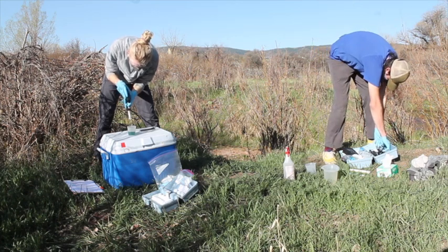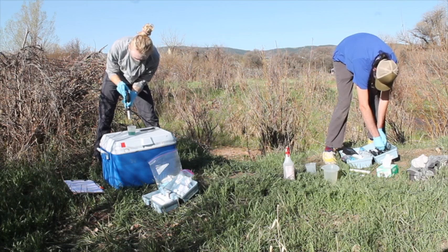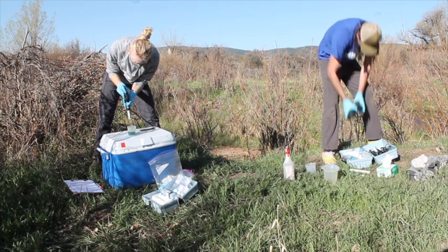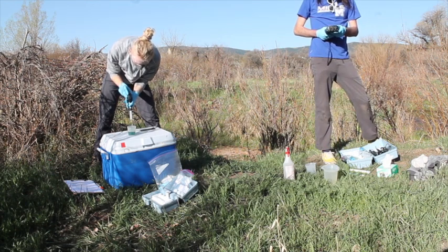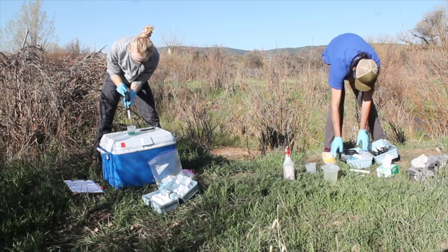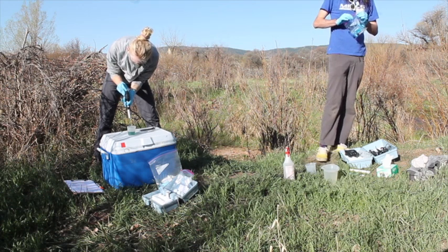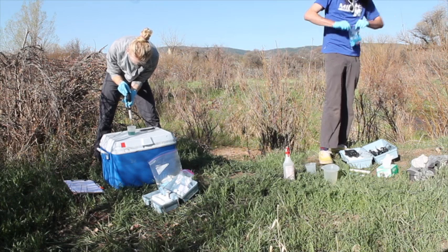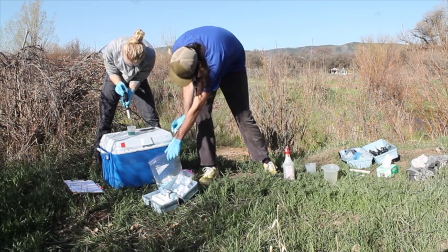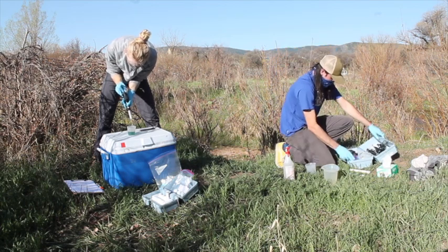Our conductivity was all around 309, so I'm pretty sure I made the right decision on sample volume. I can tell we're getting close on the alkalinity endpoint. If you find that you're titrating forever, you probably either made the wrong decision with the acid concentration or your sample volume. Alright, since we're done with this I can pack it up.